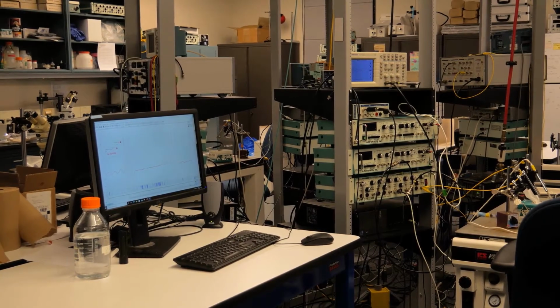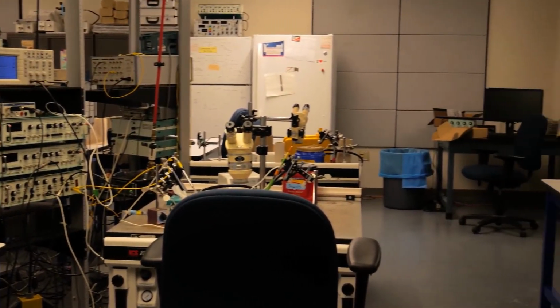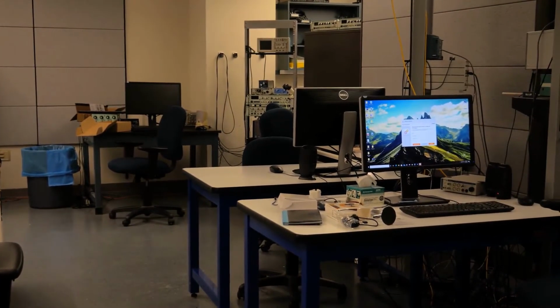I think the ultimate innovation of our project is that we're able to bring calcium imaging of neurons into the undergraduate laboratory classroom. Along with that, I think it changes the culture of the class, which has always had a mixture of engineers and biologists, but they don't often talk to each other and work together. They tend to segregate in groups in the class. But I think the curriculum we're designing will force students to look at all aspects of what's going on, not just the biology, but like you say, the optics and the physics and the engineering skills and putting things together and testing the instrumentation.